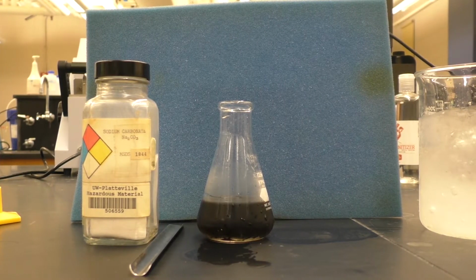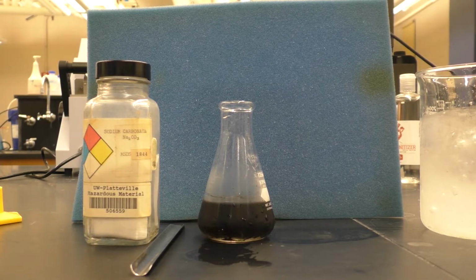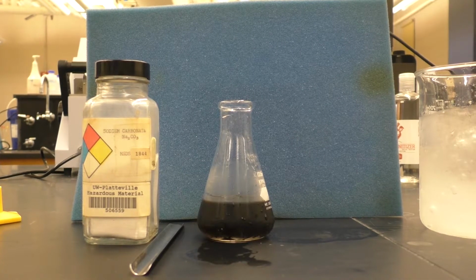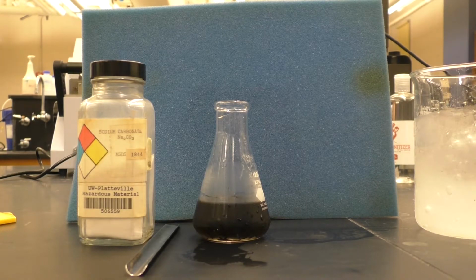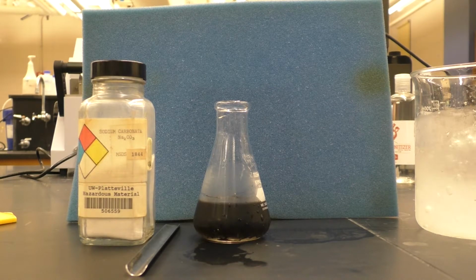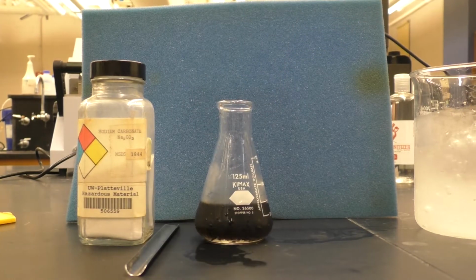Now, we need to be very careful when we do this, because when sodium carbonate acts as a base and gets protonated, it forms carbonic acid, which decomposes to produce CO2. So we'll get a lot of bubbling, but we're essentially going to add in small scoops and stir with a stir rod in between each addition, just to get us to the point until we see precipitate form. We'll do that very carefully.